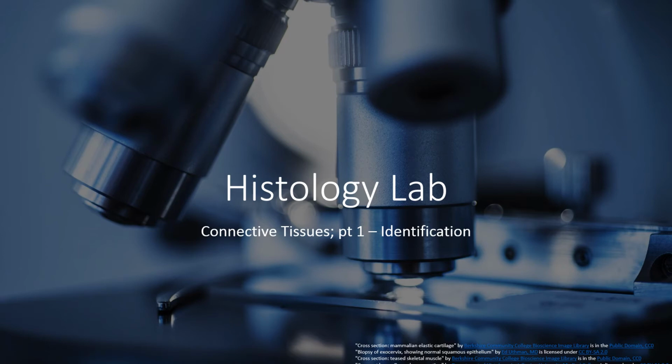Welcome back to your A&P lab. How'd it go with the epithelial tissues? Remember, I'm here if you need help recognizing the tissues. This week, we're going to continue developing our eye for tissues.